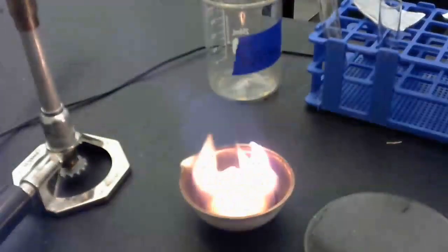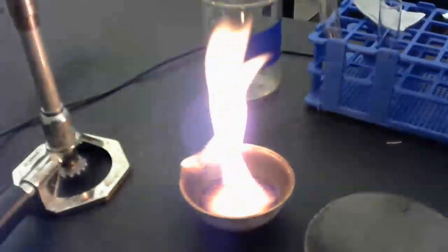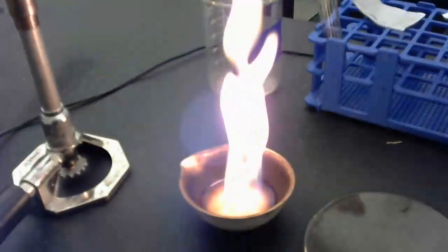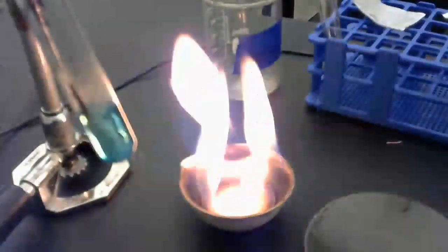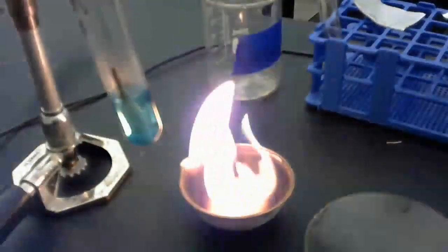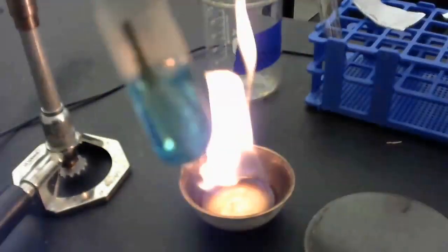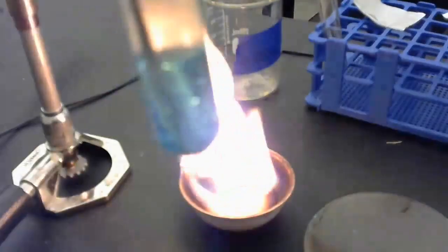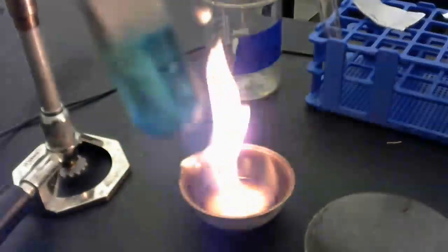Now, another thing I wanted to bring your attention to while that burns is, if you want to take a look, this is again my silver and my silver nitrate and my copper. So you can see it's a deep blue now, and I have produced a real fuzzy substance, and that fuzzy substance is solid silver that's being produced.